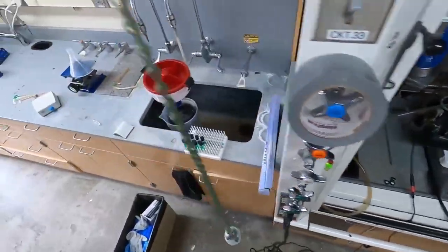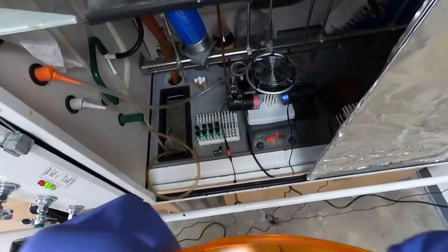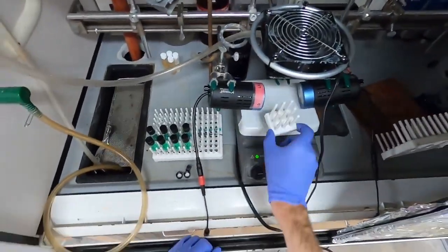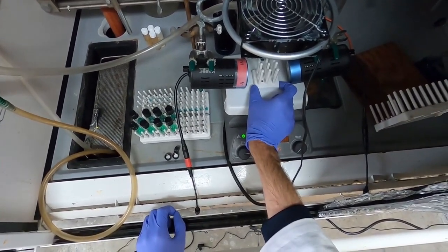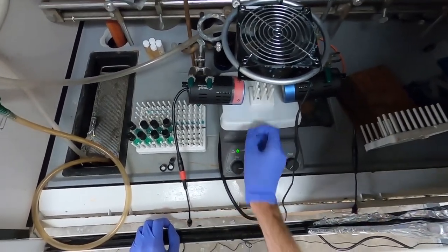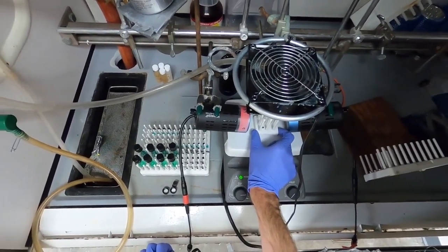Here is the photoreactor. And what we've got going on here, I'm going to put on these safety glasses. These are orange glasses. They block the blue light from coming through. So we'll put those on. And what we've got going on here is a little vial holder. And we'll put the 4 vials in here, put them under here. And the reason I do that is because it ensures that you put the vials in the same place every single time. Same distance from the lamps, and it's all uniform and consistent. Moving it left or right, forward or back, even a little bit can lead to some pretty different results.